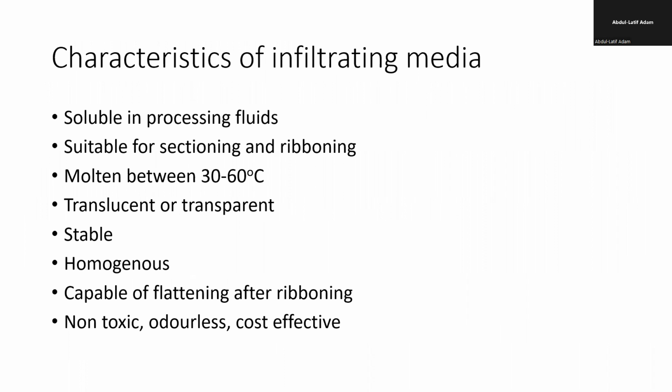So as I've mentioned to you, characteristics of an infiltrating medium: you should be able to mix with the clearing agent. You should be able to provide good sections, ribbons. So ribbons are continuous in serial sections. If you cut the section, you should be able to have serial sections.